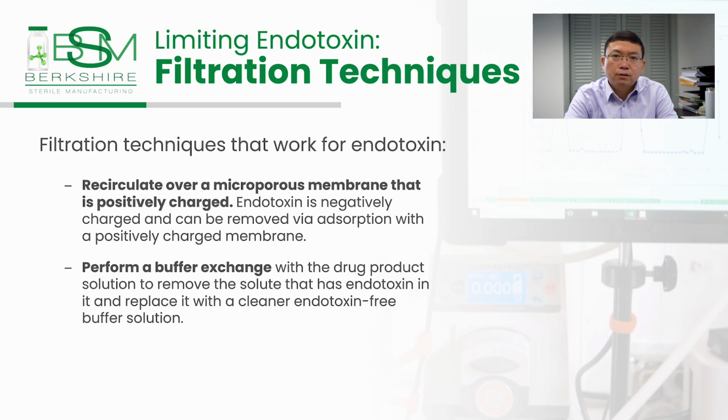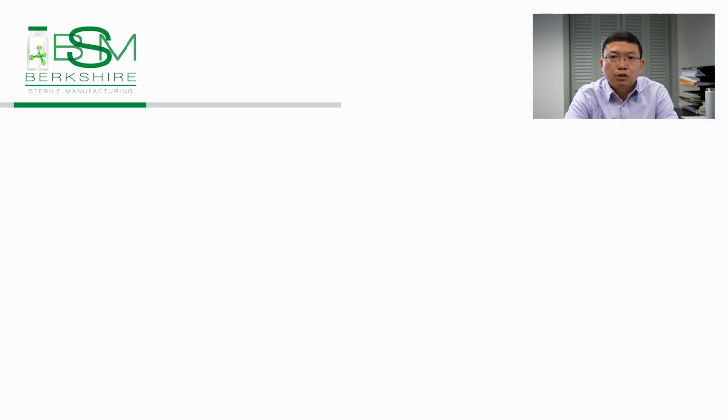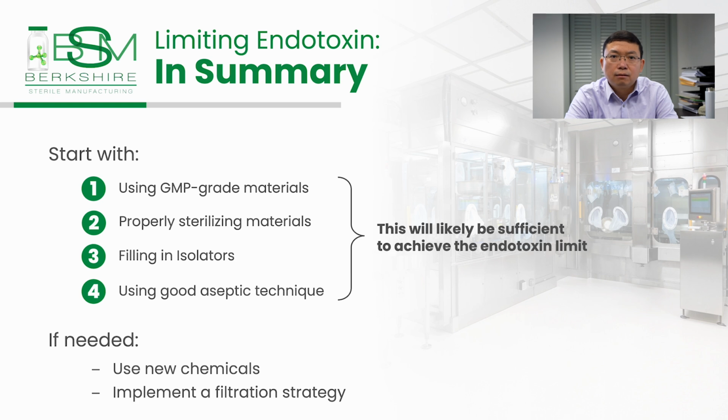For small molecule drug products, we can perform ultrafiltration. This process involves sterile filtration followed by filtration with a smaller pore size membrane sufficient to reduce endotoxin levels. This is only useful for small active ingredients, since proteins and larger molecules would be filtered out in the process. There are other filtration processes we can employ if the endotoxin level needs to be reduced further. However, for most projects, endotoxin can be effectively limited through good process control and using high-quality materials, chemicals, and facilities.